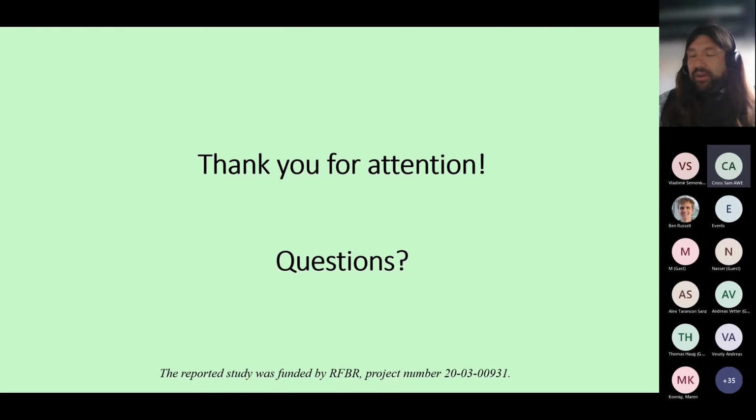It's very nice. And again, trying to take out valuable materials, radionuclides, out of waste is at the end of the day an upcoming topic. The amount of activity you had in your original solution is quite impressive. It's a pity that actinium-227 is a bit difficult to get out of that, I guess. There might be some applications for that, but that's probably going to be a quite tough separation to get actinium-227 out of that, depending on how much of the rare earth is still there.